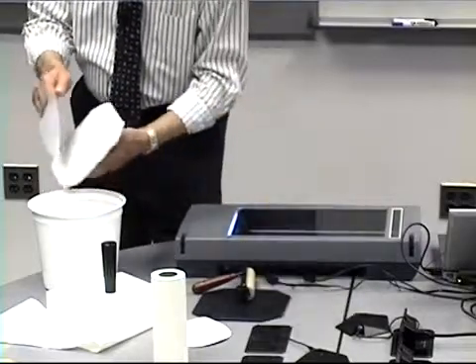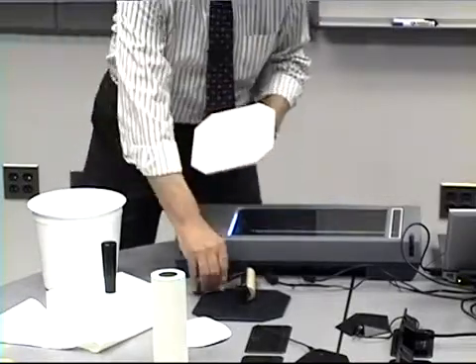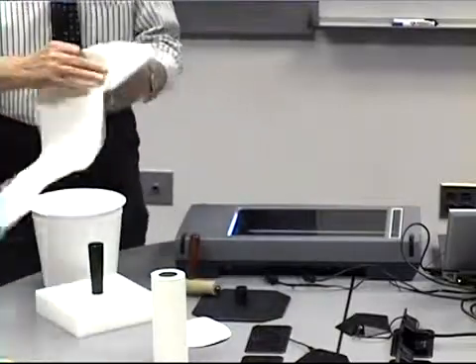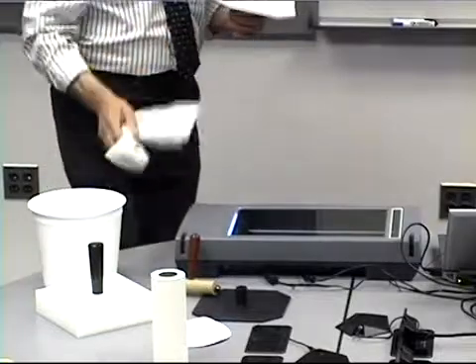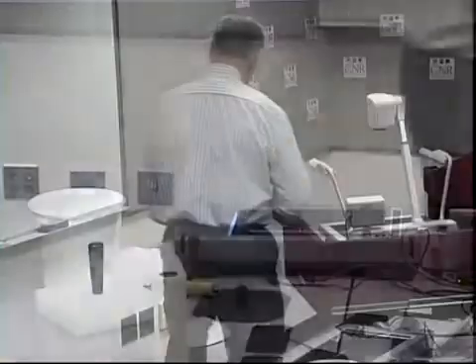And we'll put it on a white background, simulating the blotter paper, and we'll roll off the excess water, and we will very simply blot off the excess water, again making it relatively dry, so we don't want to screw up the expensive 8200 scanner. And I will show you this over here on the table. I don't know whether we can focus this or not, Bill. Is that in focus? Yes, you can see that the writing shows right through the wet hand sheet.